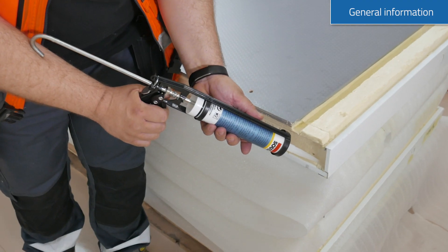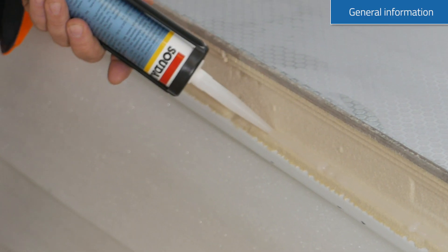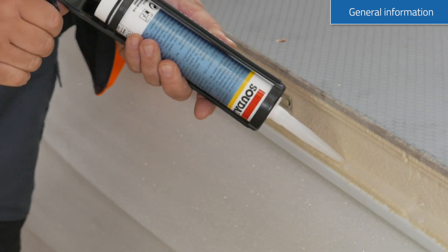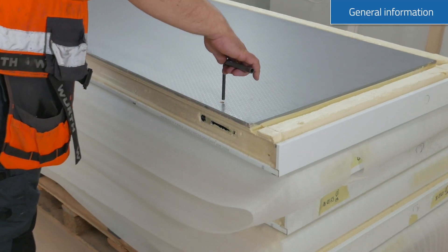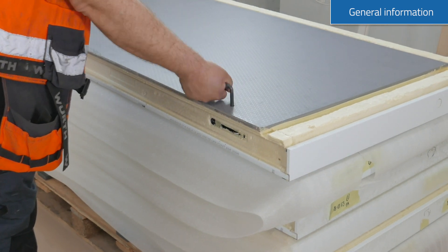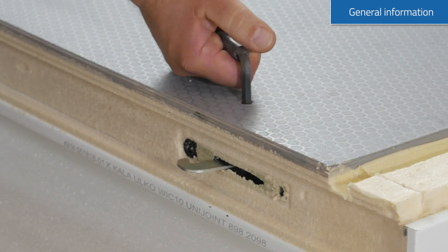For sealing the panels, please use the silicone included to ensure best thermal insulation and to create a vapour barrier. Your walk-in room panels are factory made to fit each other seamlessly. Use the included tool to lock the panels tightly to each other.